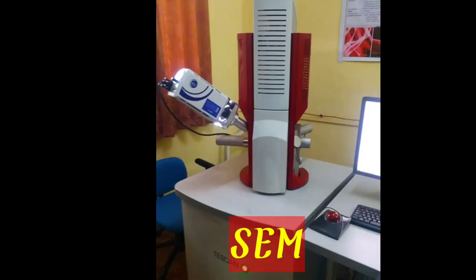The next instrument is the SEM, Scanning Electron Microscope. The SEM works on the principle of applying kinetic energy to produce a signal from the interaction of electrons. The SEM is a type of electron microscope that produces images of a sample by scanning the surface with a focused beam of electrons.